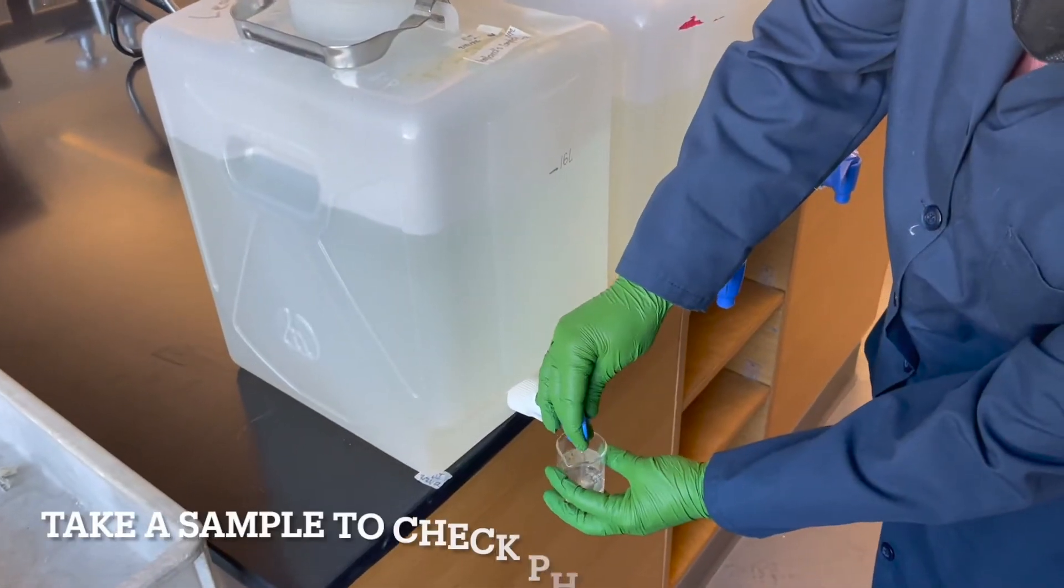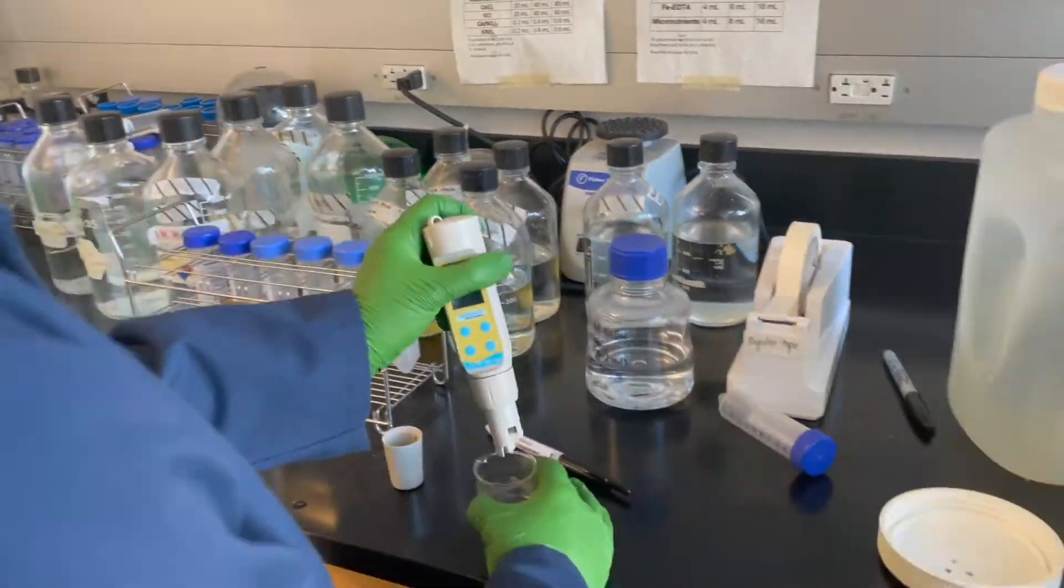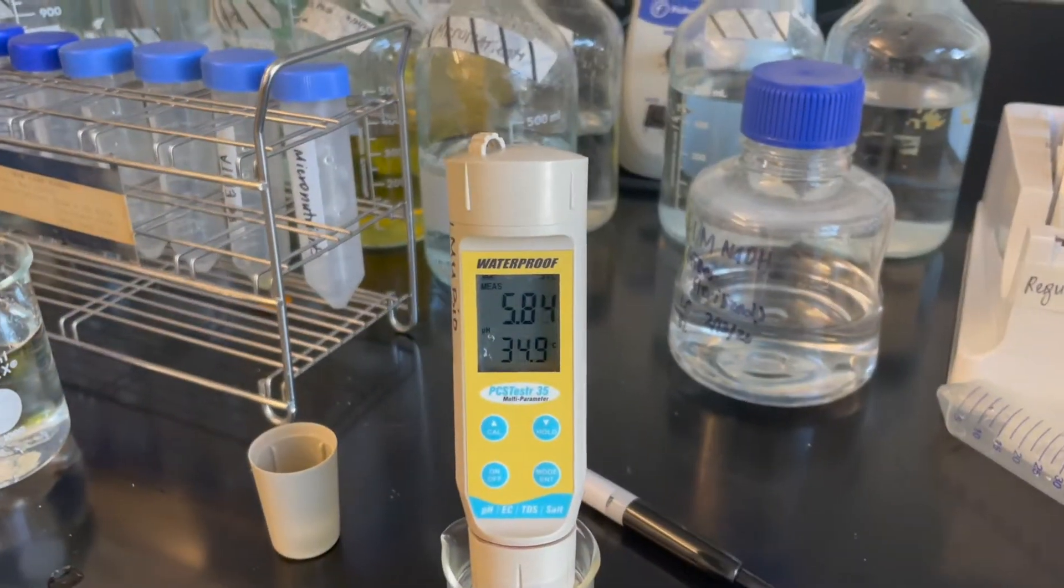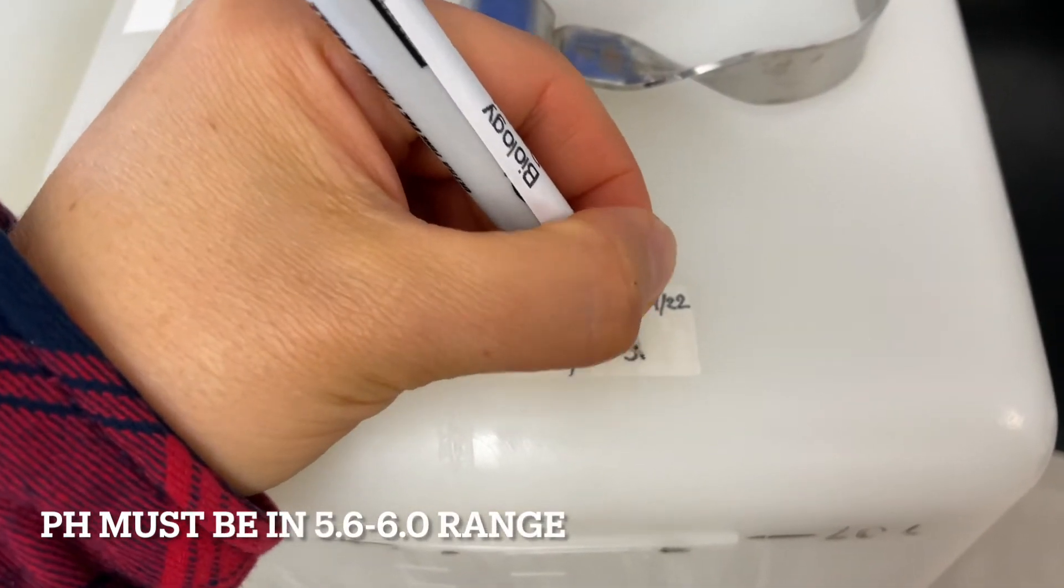The final step is a pH check. Drain some Hoagland's and use a pH meter to double-check the pH is within the range. Write down the pH and you're done. Don't forget to clean up.